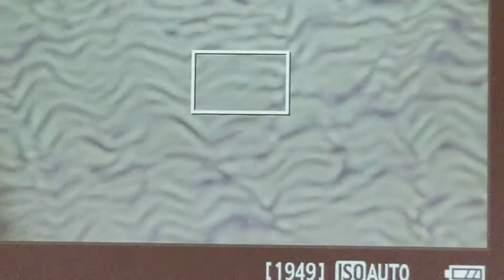Okay, look how pale that is, right? So it's almost like a light yellow color. Look at it, that doesn't look like anything to me, right? But when you enlarge it, now you can kind of see the wavy lines, right? See the lasagna noodles starting to kind of pop up in here? There you go, all right? Making it kind of hard to get real focused without it kind of losing its contrast.